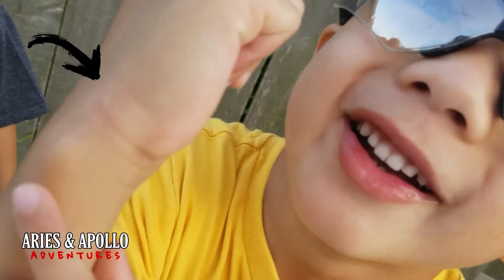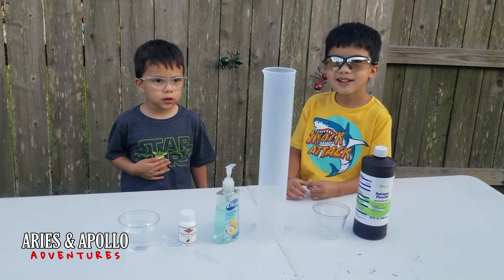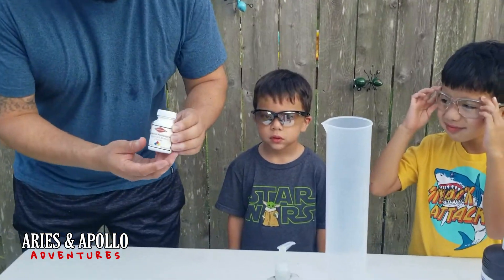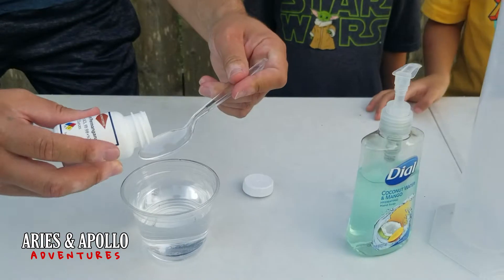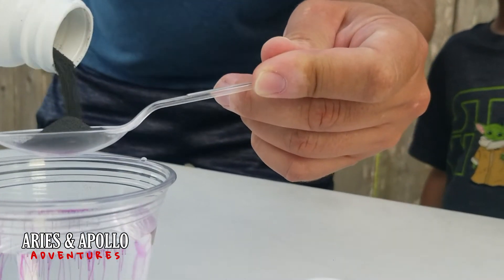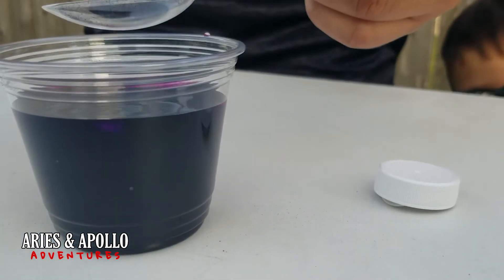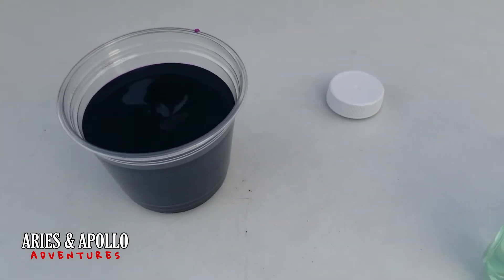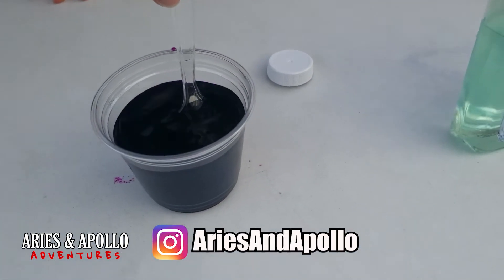Okay, you got bit by an ant? Well, that's not gonna stop us. We're gonna do this — about a tablespoon of potassium permanganate. It's just a black powder and we're gonna put some in here. Get a close-up from the side so you can see how this changes color. All right, so it's purple — that's interesting! Look at the spoon, look at the color!